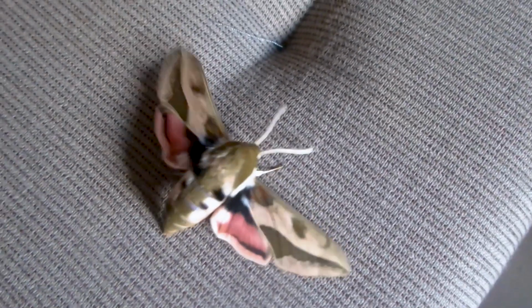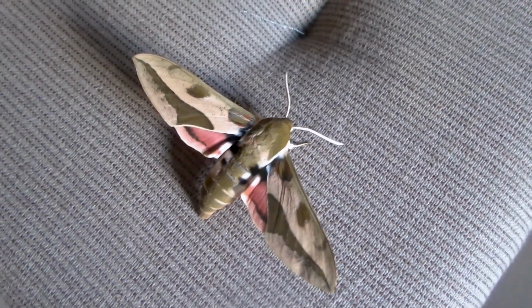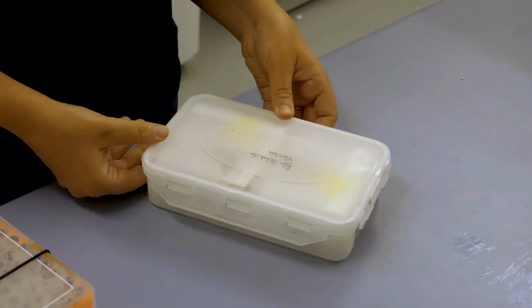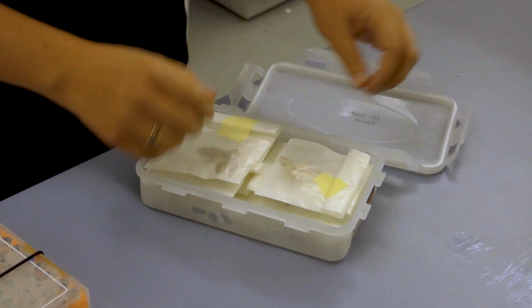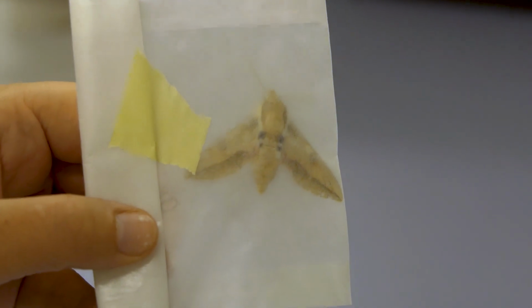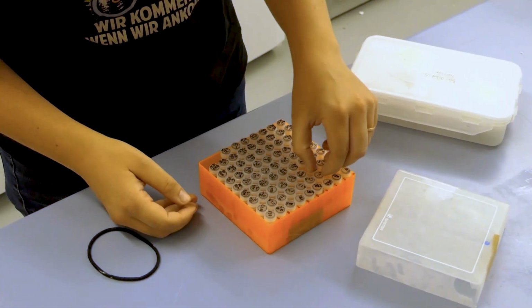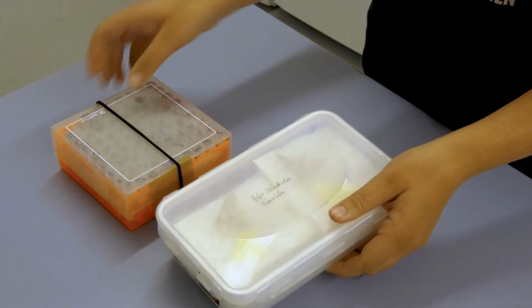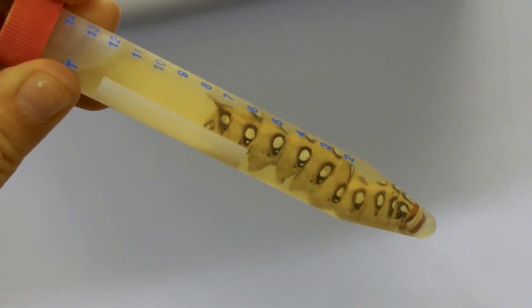All of us have our own favorite organisms for our studies, but not all of us are lucky enough to be able to breed them. In the best case, we're able to go to the field and collect fresh tissue. In our case, Franziska, a PhD student in the priority program TAXON-OMICS, was able to collect moths in the field and preserve legs in absolute ethanol for molecular genetic laboratory analysis. She keeps them in the freezer and can take out comparative samples, such as these larvae, whenever she wants.